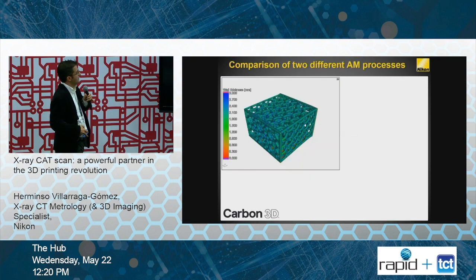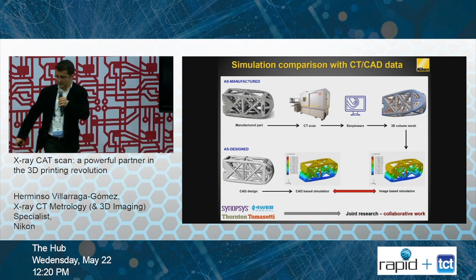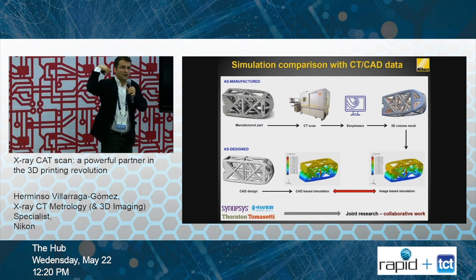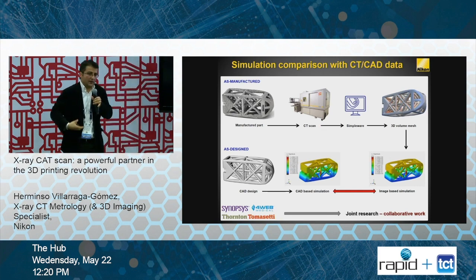One more, that one. So that's a medical part. This goes into the spine of your bone. It's a medical application. And from seeing the part, you know that it has a high rugosity, which is designed like that to help the growth of your bone around the part.